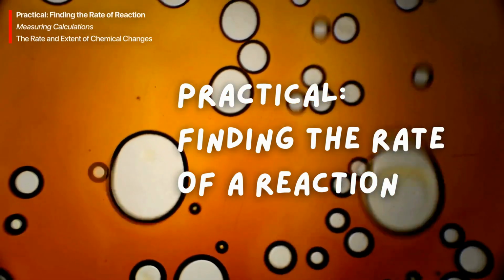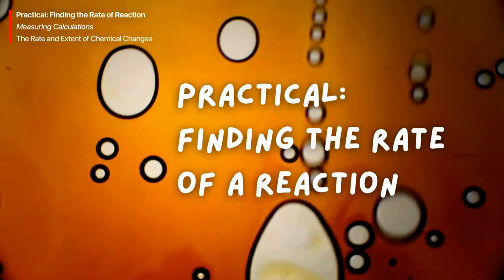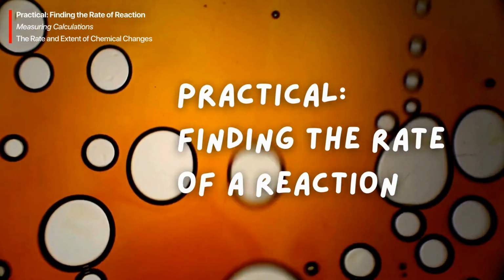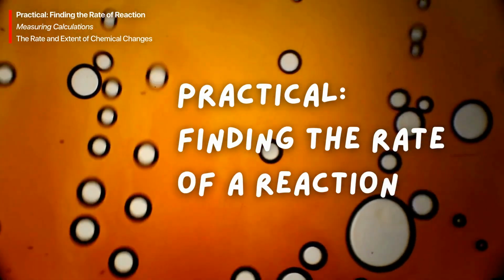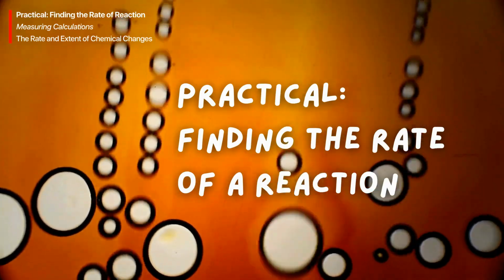Welcome to today's practical. Today, we return to the lab to explore how changing reactant concentrations can alter the speed of chemical reactions. Before we get started, remember to put on your lab coat, safety goggles, and gloves. Safety is crucial in the lab.